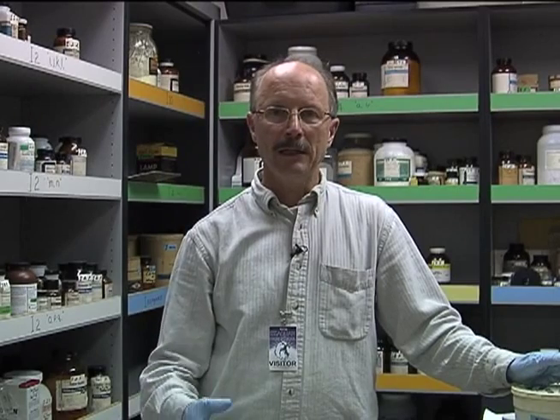We'll talk about spill management and how to respond to a spill and how to determine whether it's a spill you can respond to or it's a spill that you should call somebody in to respond to. And lastly, we'll talk about hazardous waste disposal. So if you find stuff like this really old sodium I'm leaning against, you'll know how to get rid of it. And for your more routine waste streams like your aqueous metal solutions or your alcohols, you'll have an idea of how to properly dispose of those so you're doing what you need to under the law and also doing it as inexpensively as possible.